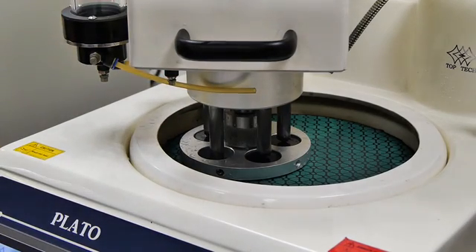In this video we are applying diamond manually, however an optional dosing unit is also available.